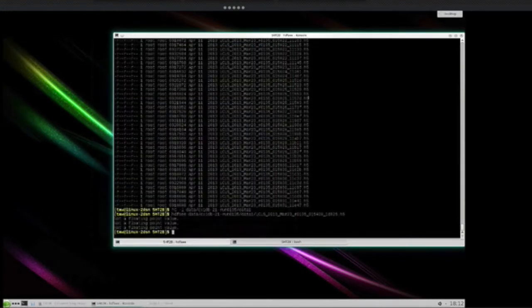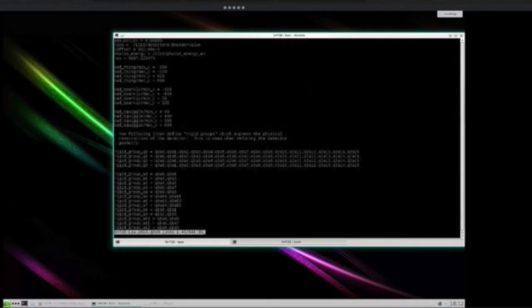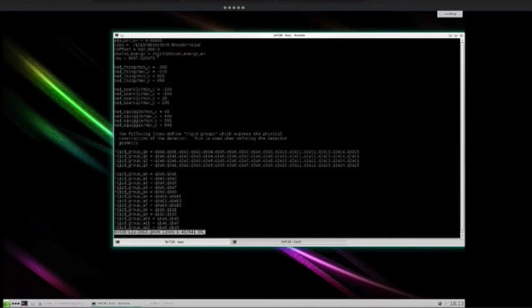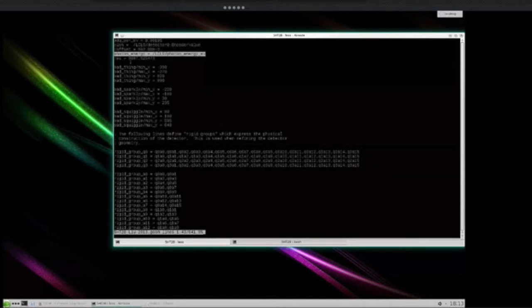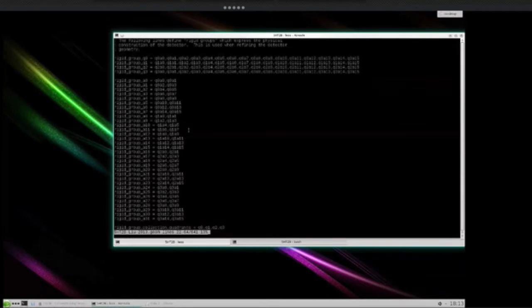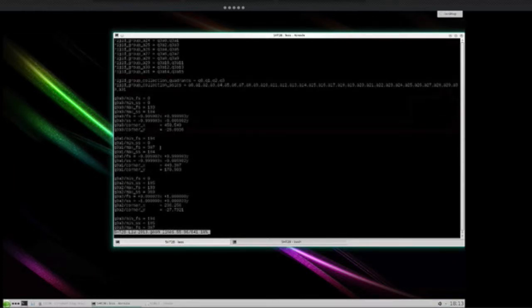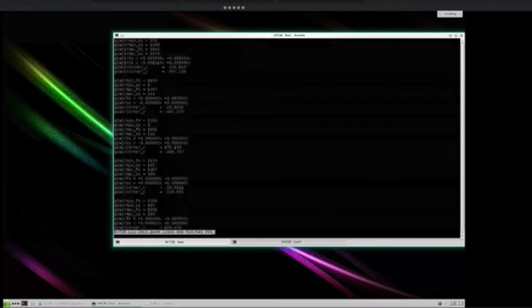I've prepared one already in this 5ht2b.geom. So let's look inside that. It's just text. It contains information, for example, where to get the detector position in the HDF5 file, and where to get the photon energy, so like the wavelength. There are some bad regions, some information about how the detector is assembled physically, and then the coordinates of all these panels and the transformation matrices that are needed for them. This goes on, there's 64 panels in this case.